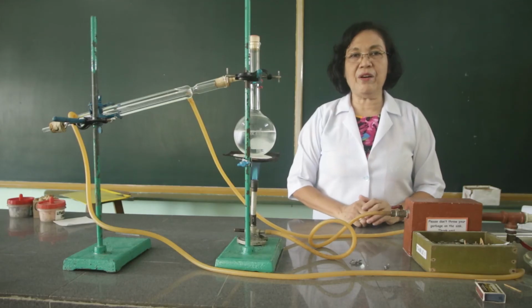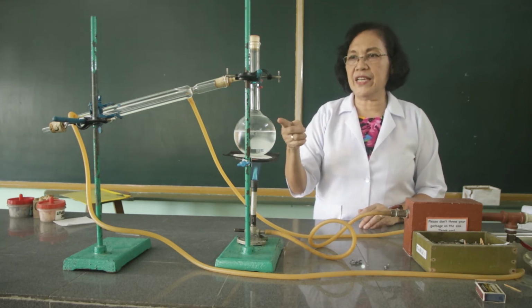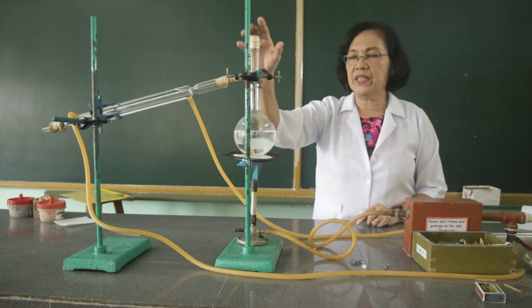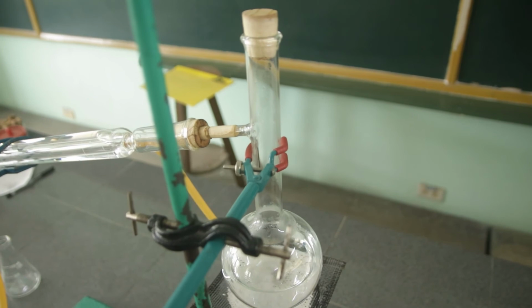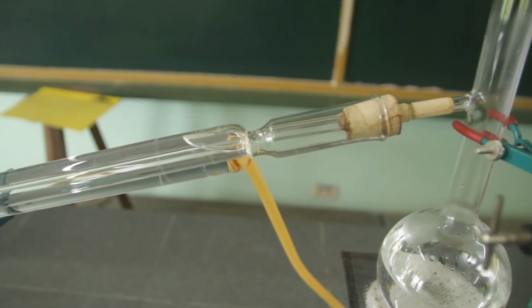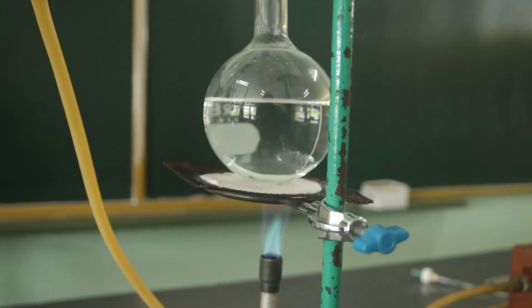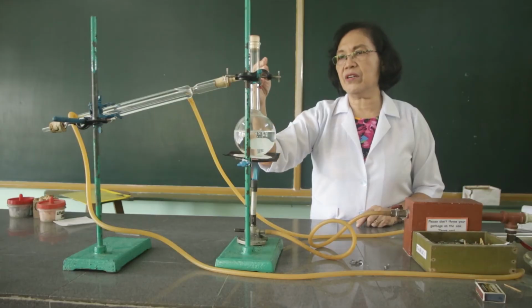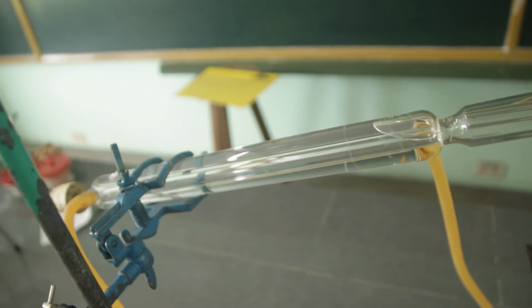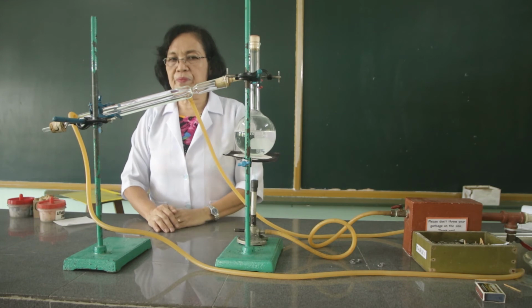The second method of purifying the water is by distillation. So this is the distillation setup. In the distillation setup, we have here the evaporation, which occurs in the distilling flask, and the condensation, which occurs in the condenser. Once the water evaporates off, the gas is converted into liquid in the condenser part. So the liquid that we're going to collect here is what we call the distillate.